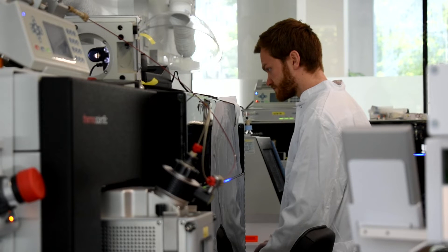As for our other high-end instruments, we can combine it with not only the EZ1200, but also the Ultimate 3000 or the EVOSEP, especially in the case of TMT, where we need the MS3 analysis for interference-free quantitation. This is a really highly powerful workflow that can be used.